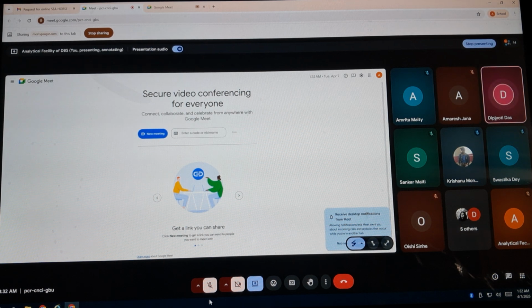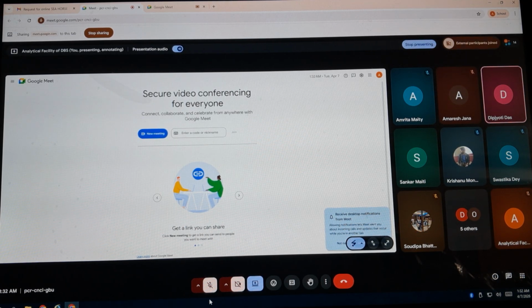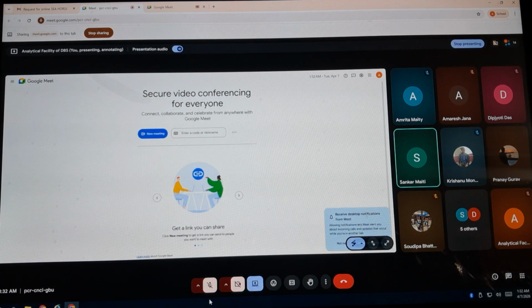Actually, somebody is recording this whole thing, right? Yes, sir, it is being recorded. Okay. So, can you hear me now? Yes, we can hear. Well, let me share this.